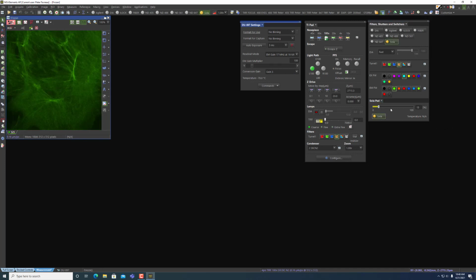And we do. Again, the primary ingredients for just showing an image here were that I needed to have the shutter open on my excitation light source, and I needed to have the filter turret set to a cube that will allow light in from a lot of different colors. And I needed to have an excitation and emission filter set that are specific to GFP. Now, if I select this filter cube that's specific to GFP and change these to empty, because I have a filter cube that has all these excitation and emission filters already in place, I should see roughly the same thing.